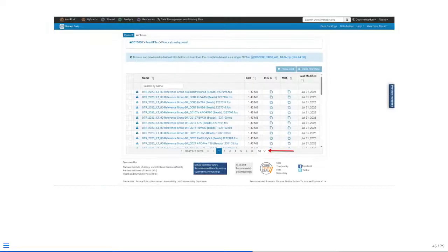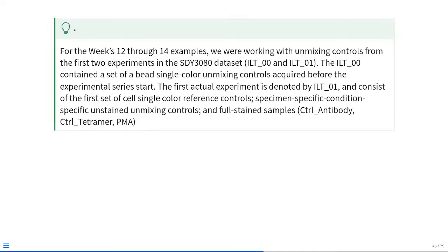So at this point, you can see when I'm visualizing going from 50 to 200, there's over 973 items present within this folder. You can see on this side, when I'm looking at some of these speed controls, their original file size is about 1.43 megabytes, so low large, but still compatible with GitHub. But then as I start looking at the others, they get substantially larger.